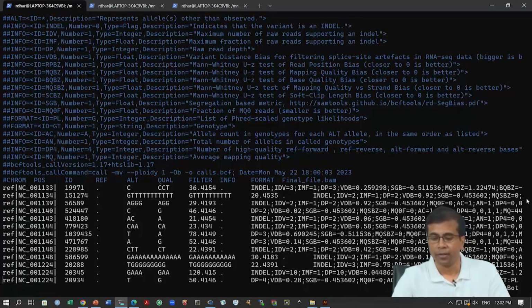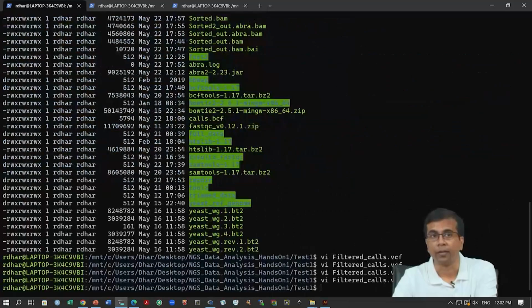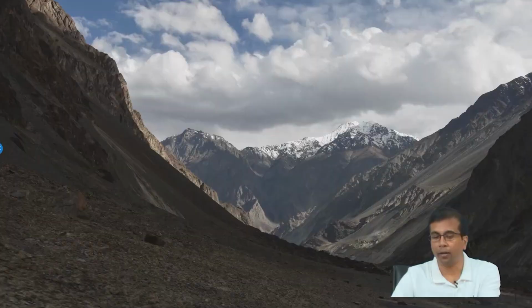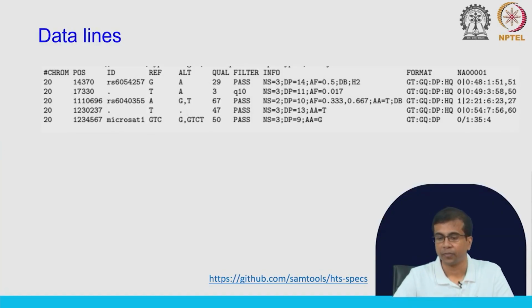Okay. So, this is done. The next step is to actually go for variant annotation. So, we will go back to the presentation and we will talk about variant annotation.